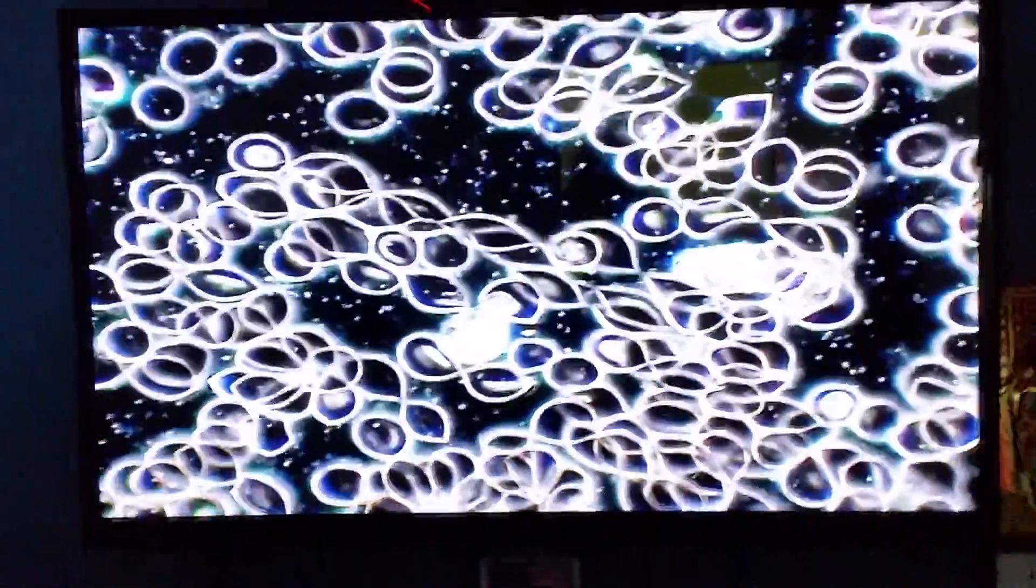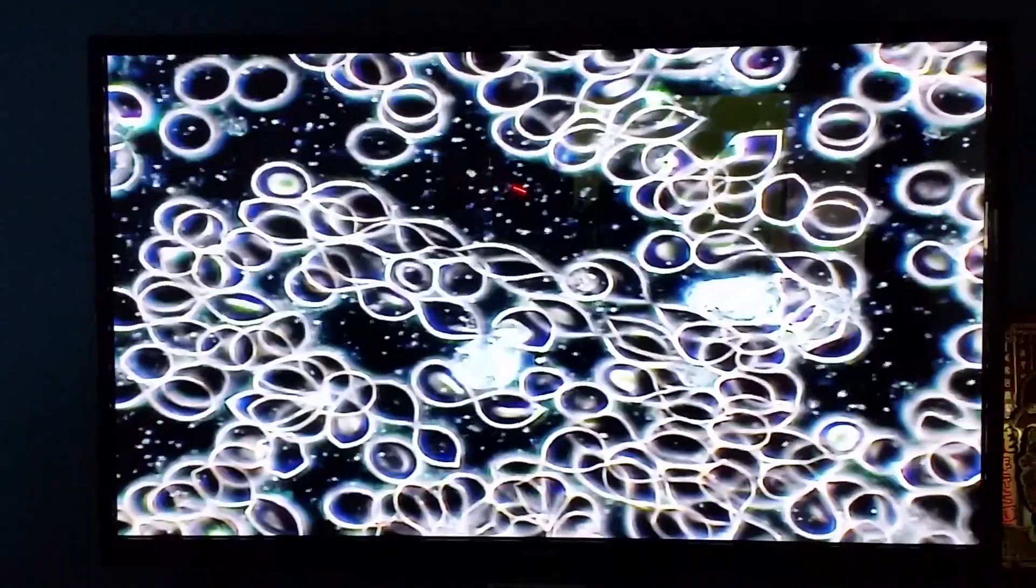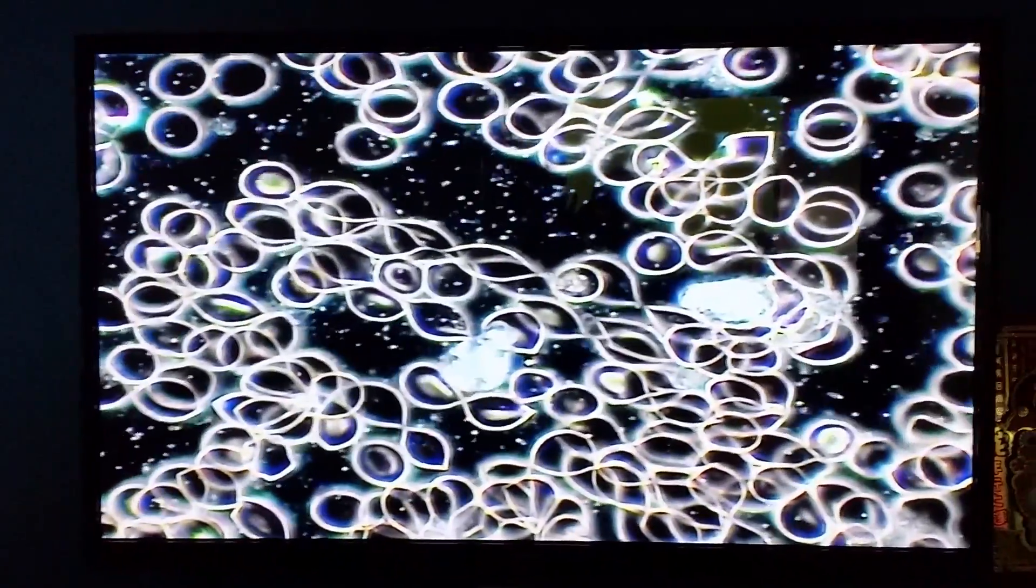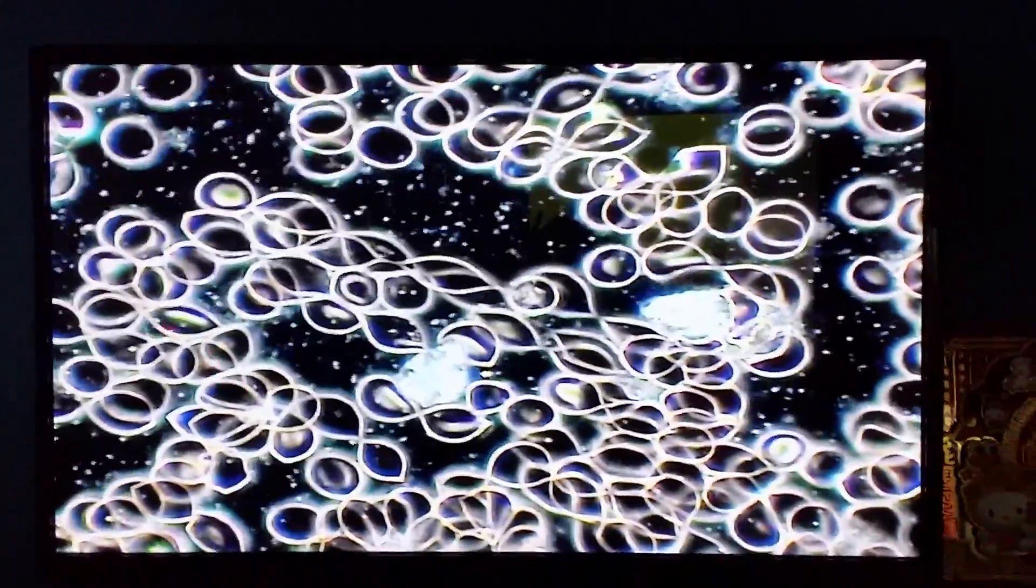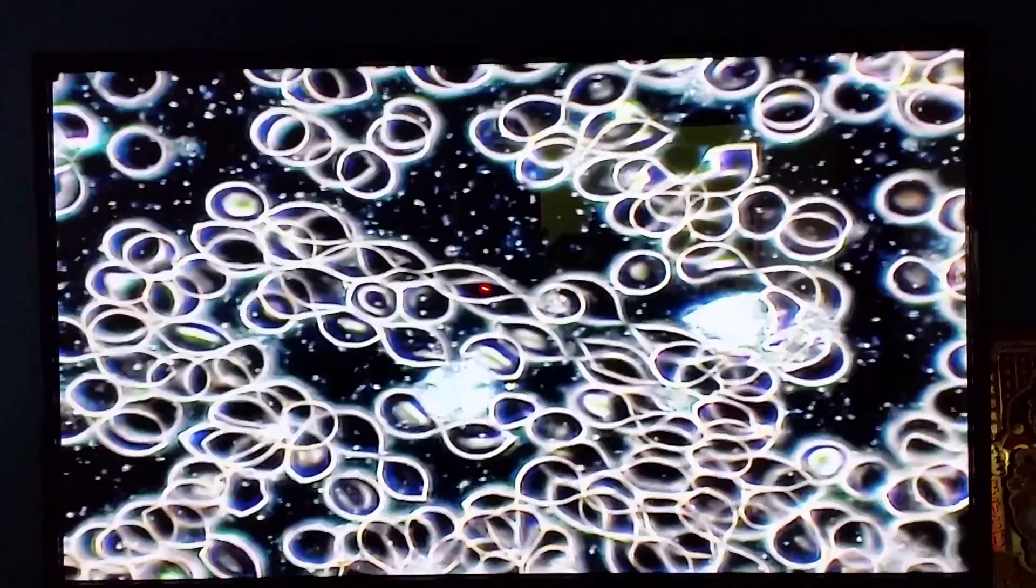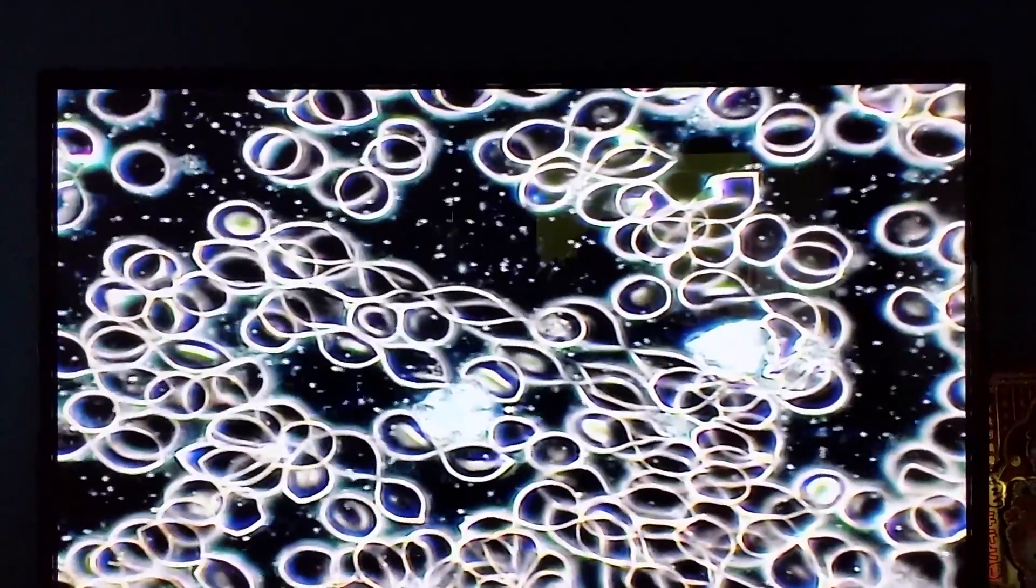I'm going to take a picture of this. These dots jumping around in the background can be lipids, cholesterol, triglycerides, or undigested food. The red cells should be separated, and these are on top of each other. They should be round. If we see cells that are pointed like this, those are indications of allergy.